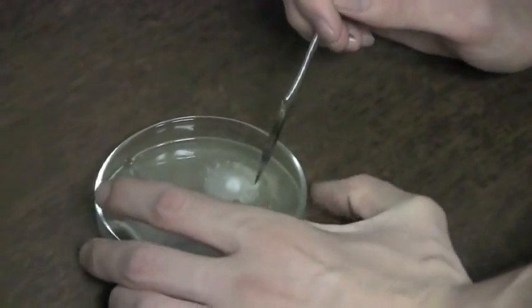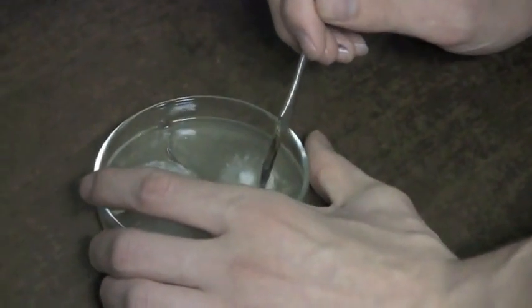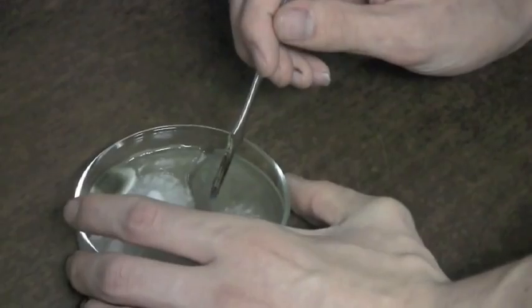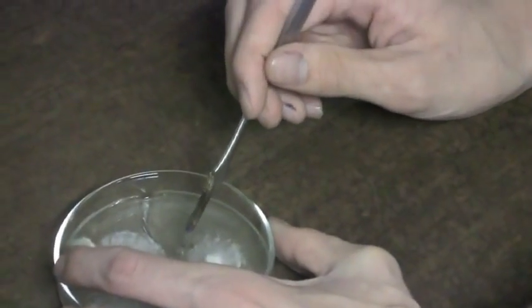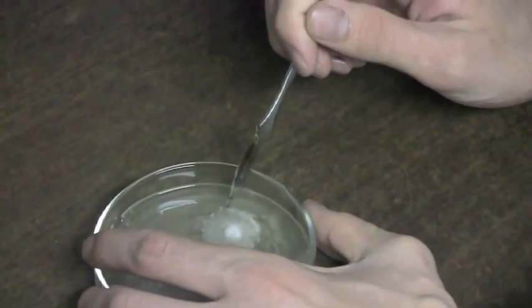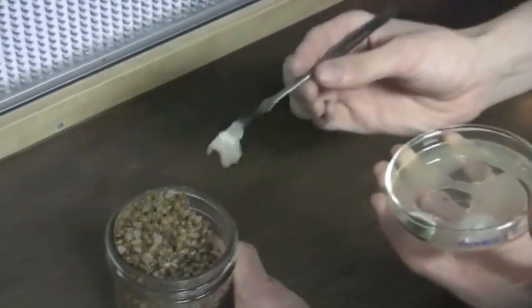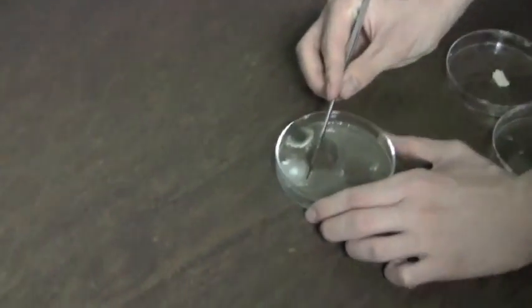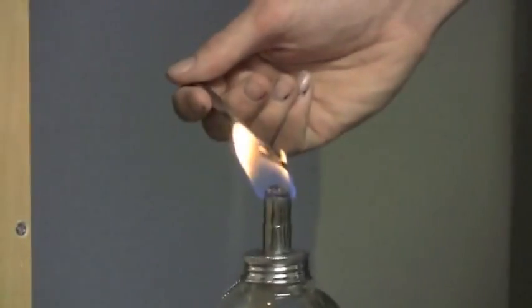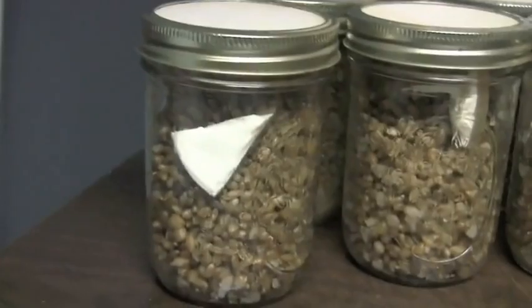The other thing that's new is we've got contamination off to the edge. There's some bacteria growing. So what Keegan's doing here is cutting out the good stuff and isolating it from the contamination. And you can see, I think we placed a wedge of hericium, and into the jar it goes, and then we can just throw away what's left over. After each transfer, you need to sterilize.